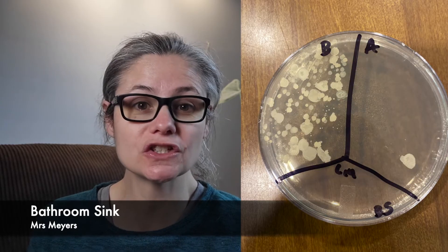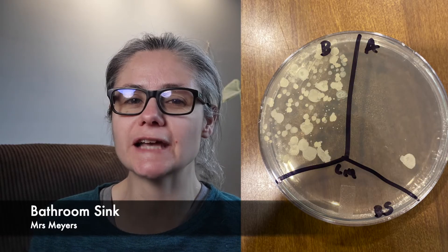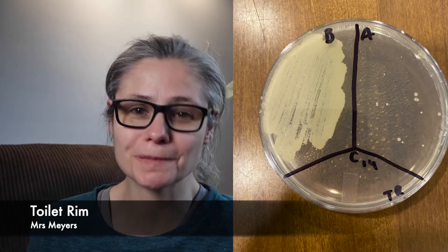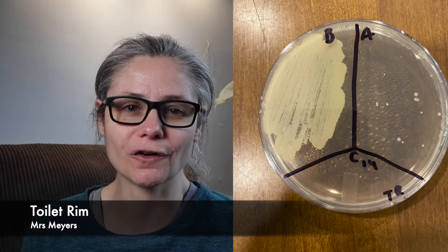The bathroom sink. In the before section, we can see a lot of bacteria. And in the after section, you can see one or two big colonies, and there's actually about half a dozen small tiny bacterial colonies on the dish. But overall, Mrs. Meyers does a great job at removing bacteria from my bathroom sink. The toilet rim. In the before section, we can see a tremendous amount of bacteria. And in the after section, there's about a dozen small bacterial colonies. So we can see a major visible decrease in bacteria, and Mrs. Meyers does a good job at removing bacteria from my toilet rim.